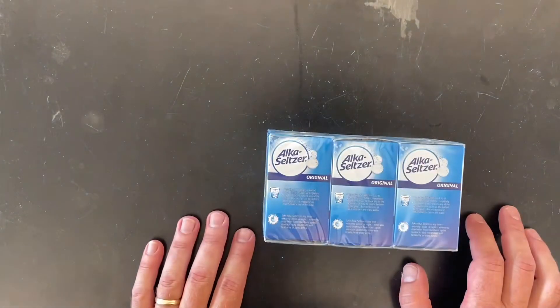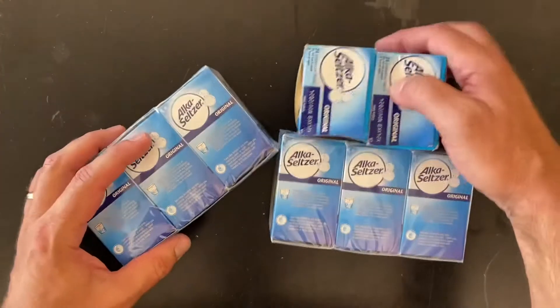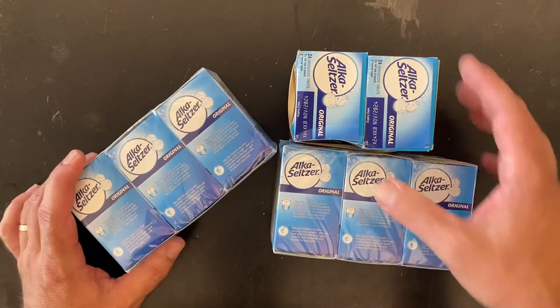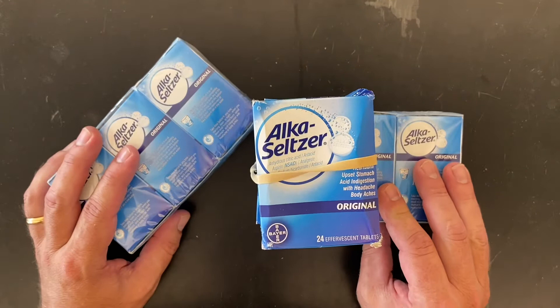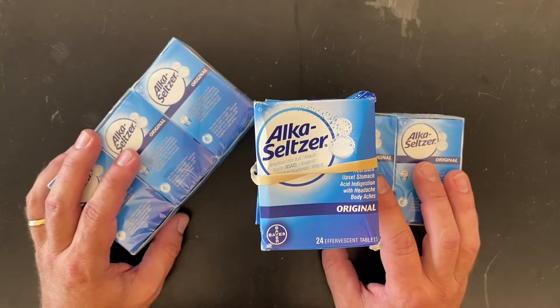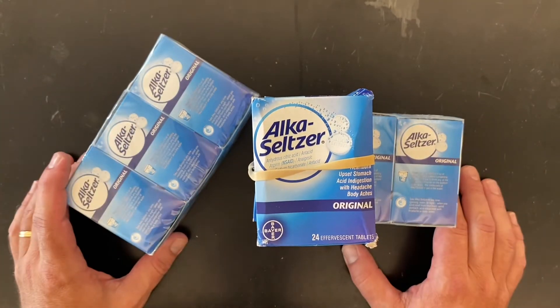Finally, you may have noticed some Alka-Seltzer. You can actually order it through scientific companies or just go to the drugstore. We use these tablets for some of our chem labs because they do a lot of cool acid-base reactions. We do a lab where we measure it before and after, measuring the gas that comes off — you know, the fizzing.